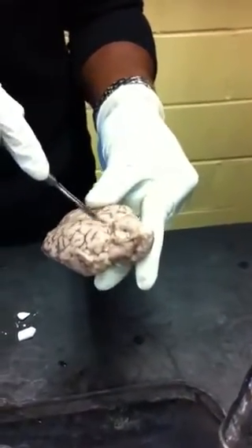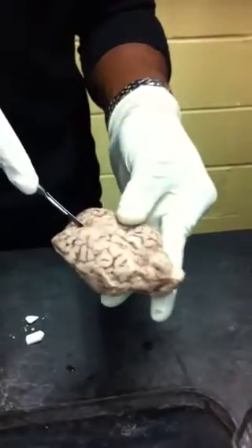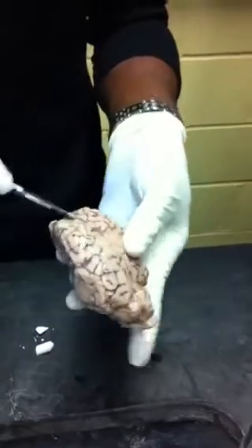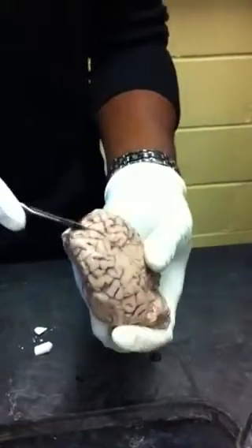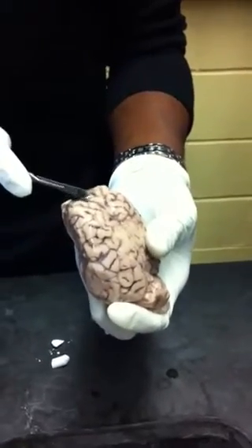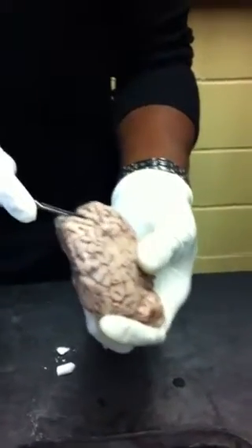What's the middle line called? Isn't it called something? The corpus callosum. No, not that. A sulcus, gyrus, something. I'm just guessing. I know the fat stuff is the sulcus.